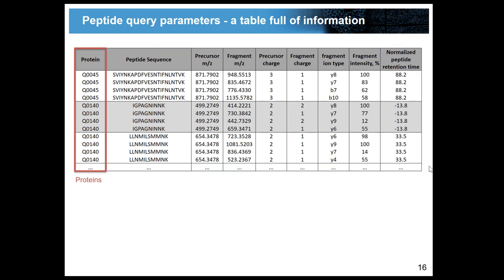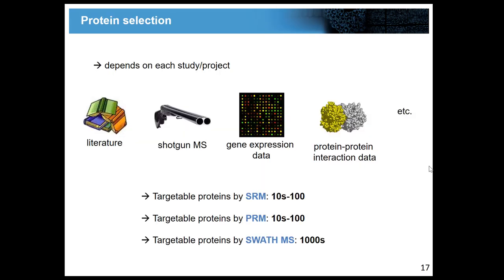So let's start with the proteins first. So protein selection. How do you select the proteins for your project? And there's actually not much for me to tell you about this other than that this depends on each project, obviously.